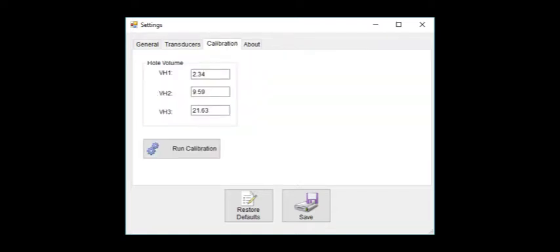The next tab at the top of the window will take us to the calibration settings. In this window, we can designate the whole volume of the calibration plugs we will be using to run the calibration. Exiting out of the settings menu will bring us back to the main screen.